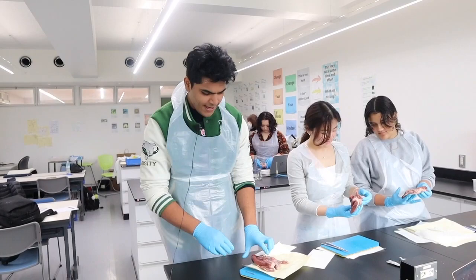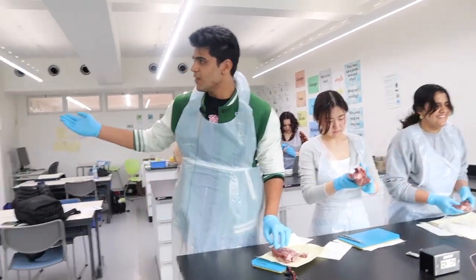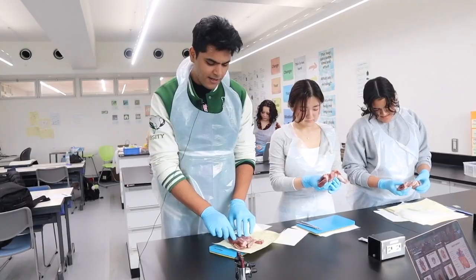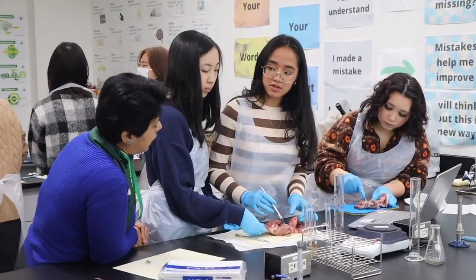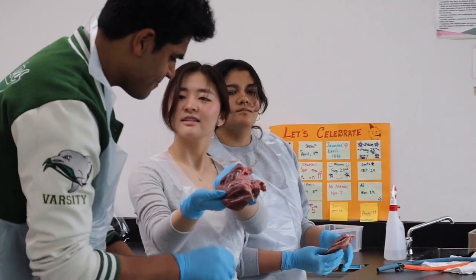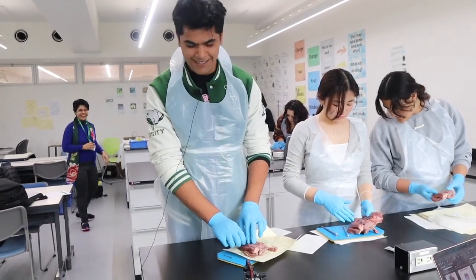Today, my class is dissecting a pig's heart, and as you can see on the board, we have a picture of the heart, and we're dissecting to find out the various parts of the heart and learn about it. But at the moment, it's not looking good because it's difficult to dissect, and it's not as what the picture shows, but I will keep trying.